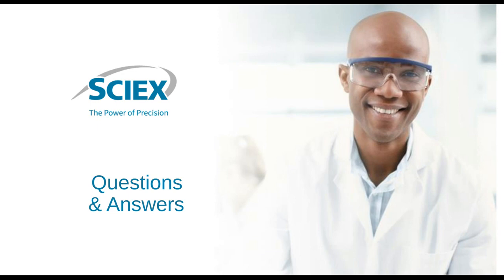Thank you, gentlemen. And now, can CE-SDS be used as a purity assay? And if yes, how robust and sensitive should it be when compared to SDS page?